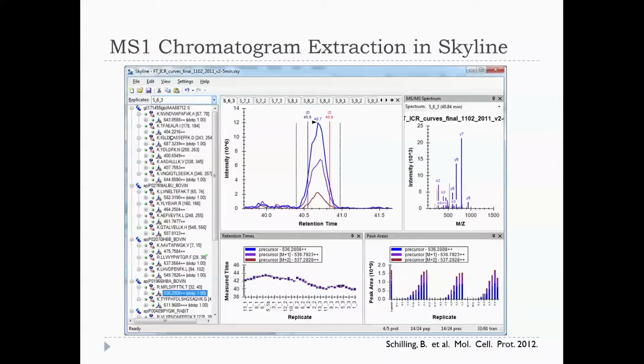Who can tell me what kind of experiment this was? DDA, yeah. And this is actually very similar to the chromatography we saw in that first thing. So we're now ordered by acquired time. But what does the peak area graph tell us about what kind of experiment this was? A time curve or a... Yeah, dilution curve, right? So it's a dilution curve experiment.